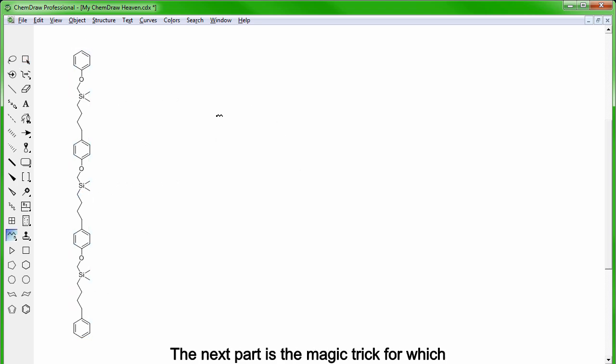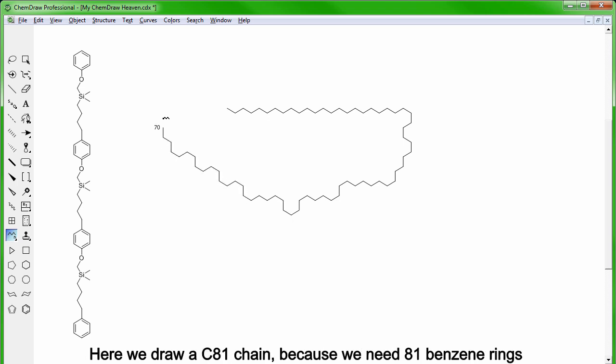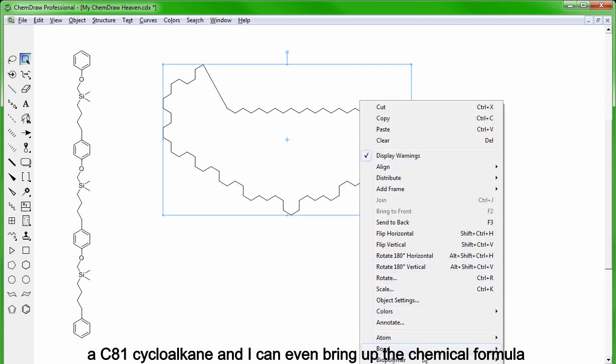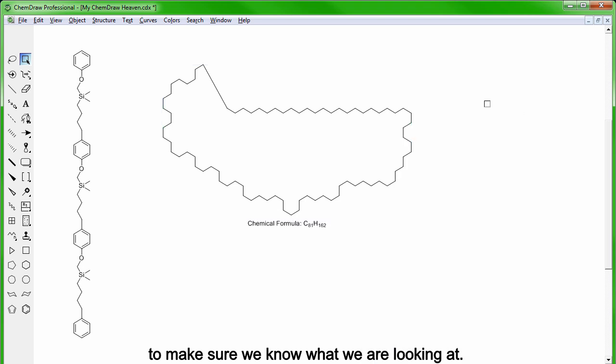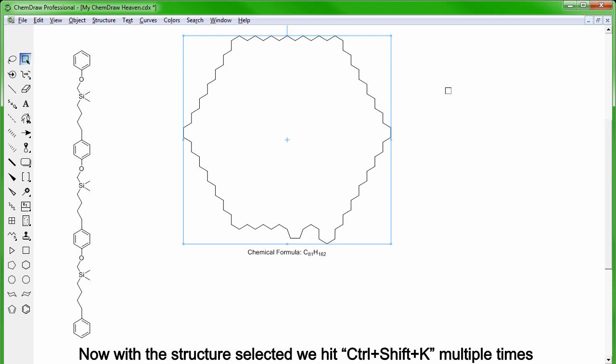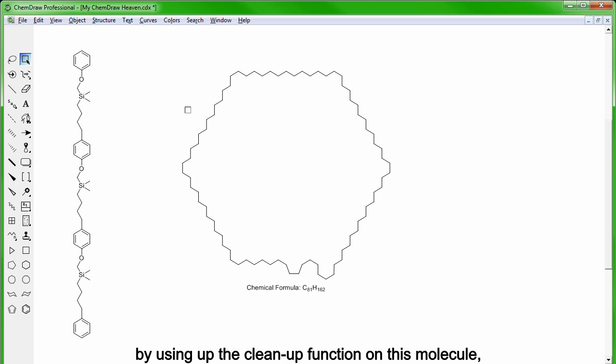The next part is the magic trick for which I'm going to take the chain tool. And remember, if you hold CTRL, the chain will follow your mouse. Here we draw a C81 chain because we need 81 benzene rings to be nicely displayed on the dendromer. We take the single bond tool and close the chain to have a C81 cycloalkane. And I can even bring up the chemical formula to make sure we know what we're looking at.